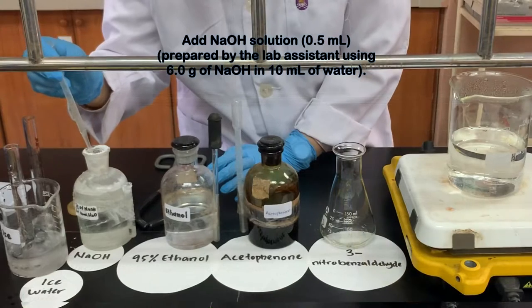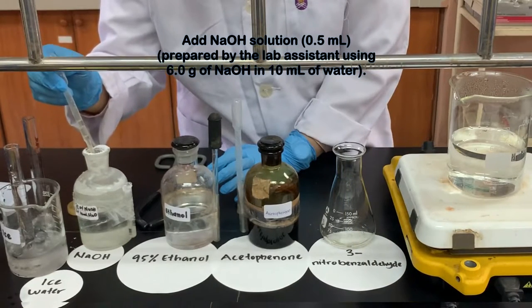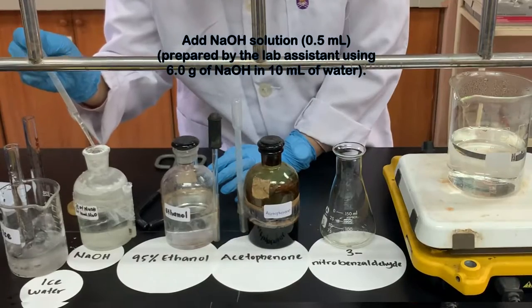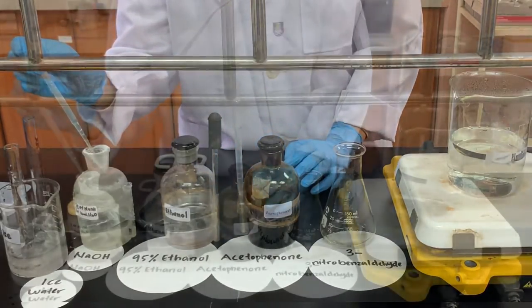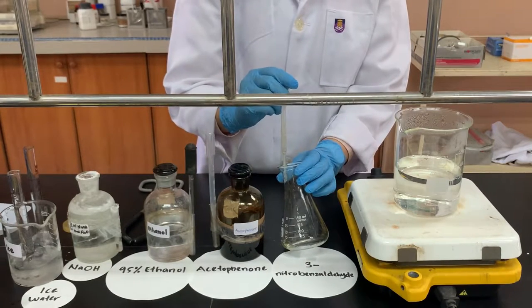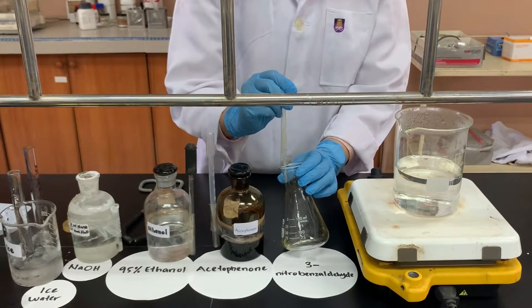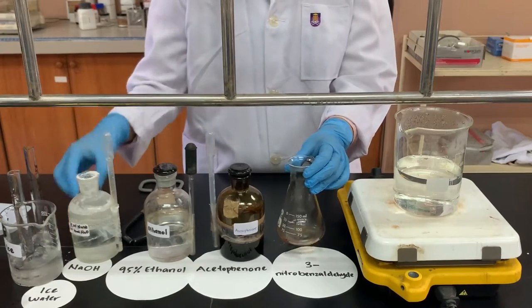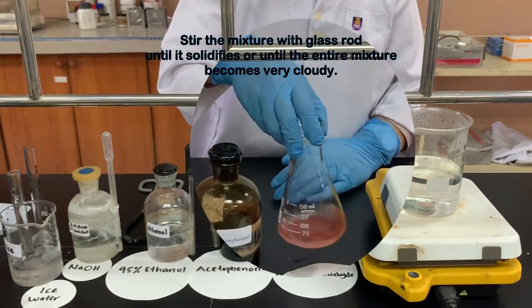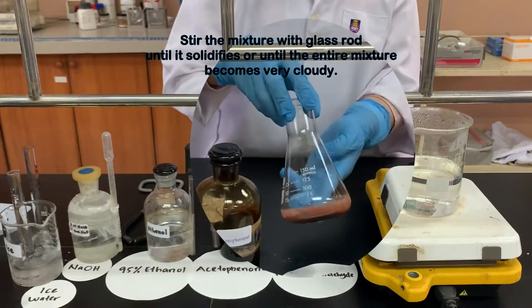Add 0.5 ml sodium hydroxide solution, which was prepared by the lab assistant using 6 g of sodium hydroxide in 10 ml of water. Stir the mixture with a glass rod until it solidifies or until the entire mixture becomes very cloudy.